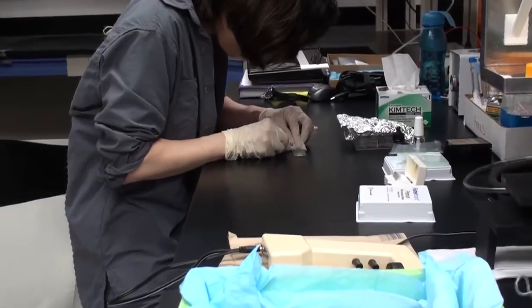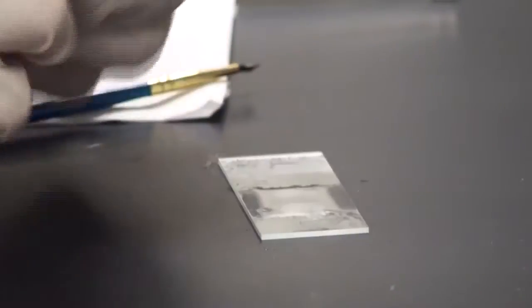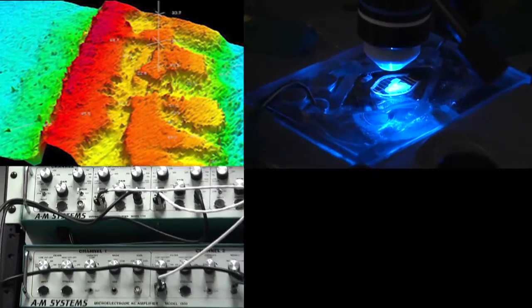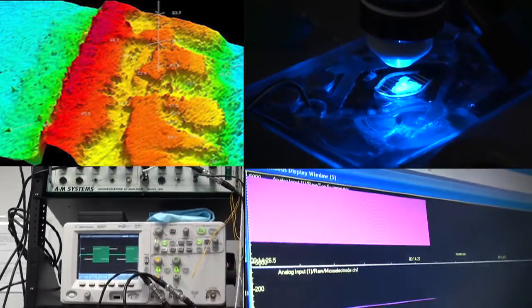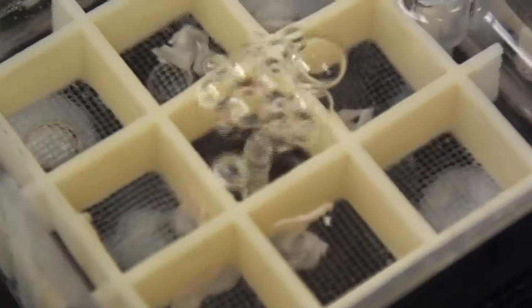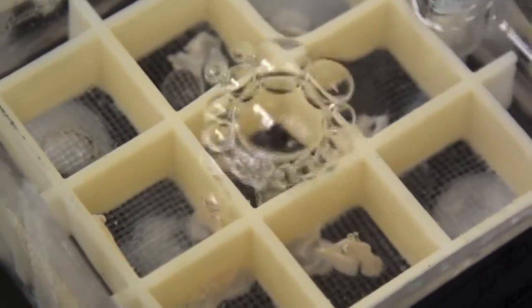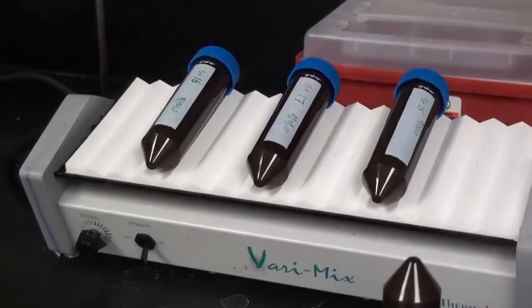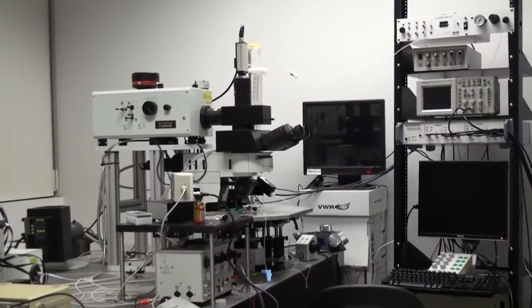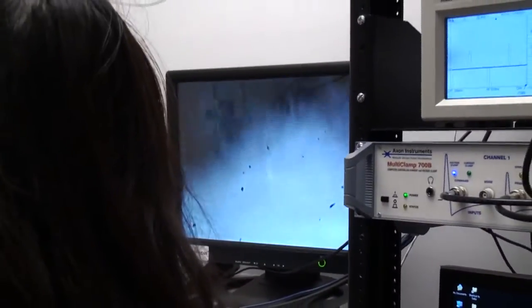My graduate students are really kind of the workhorse in the lab. In the lab, we have some setups to do behavior, so we can do behavioral conditioning. We can do confocal microscopy. We can do multiphoton microscopy. We have several ultrasonic neuromodulation rigs where we can stimulate brain activity using ultrasound. We also have culture facilities where we make primary cultures, slice cultures, various gene transfection stations. So basically we do a mix of everything, and the lab is fairly self-sufficient and independent. We have most everything here on site.